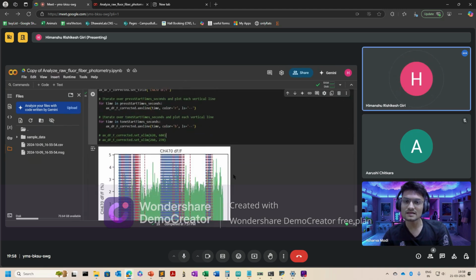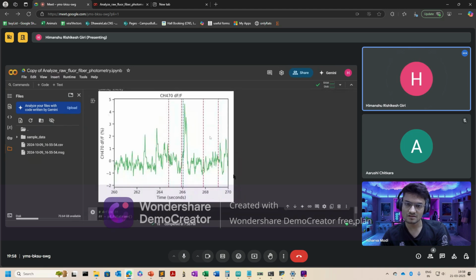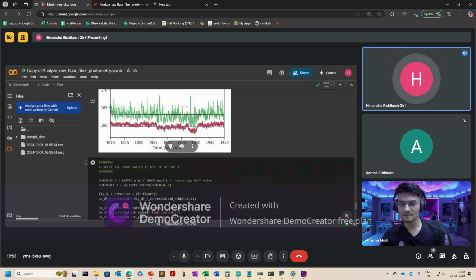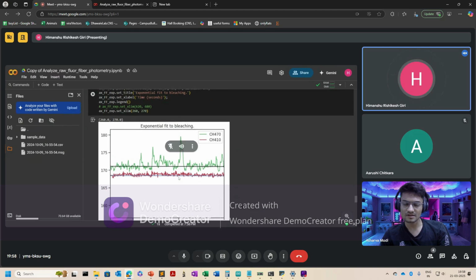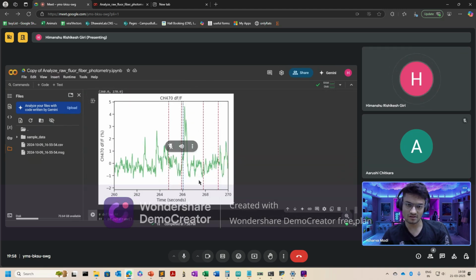You see this higher peak after that blue line? That is actually a tone or something, right? Yeah, but that is after the tone. The blue line is the tone. Yeah, this corresponds to this. Okay, then you plot the z-score. It will be a very similar plot. Even the values will match.